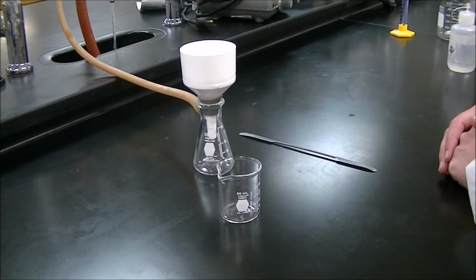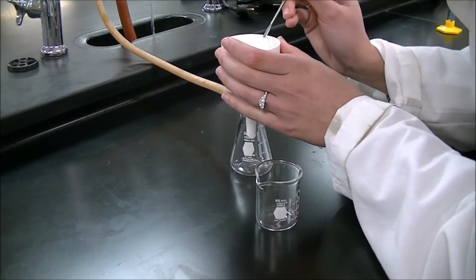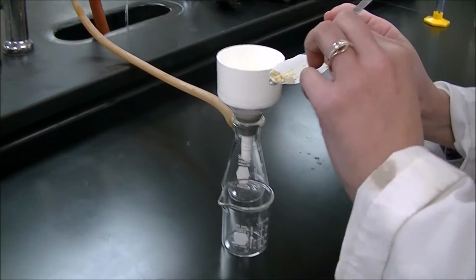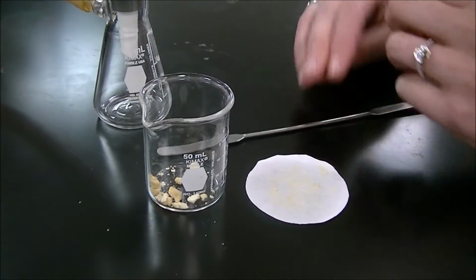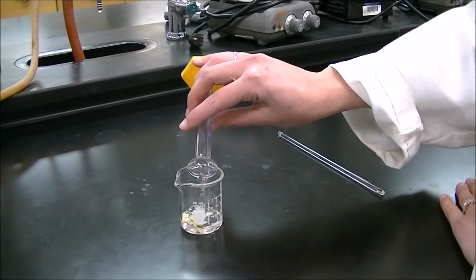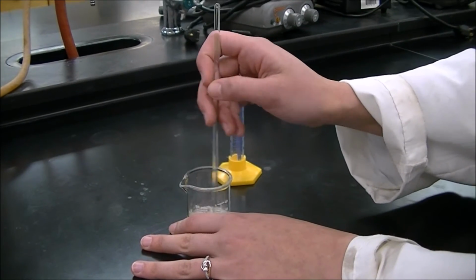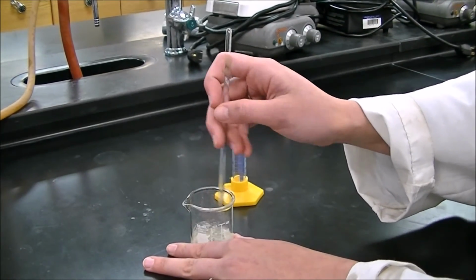After rinsing 3 times with hexane, remove the filter and transfer the solid product to a small beaker. Add 10 milliliters of water to your small beaker. Next, stir the product vigorously because you want to dissolve all of the succinimide byproduct in the water. The desired product has a very low solubility in the water and will remain a solid.